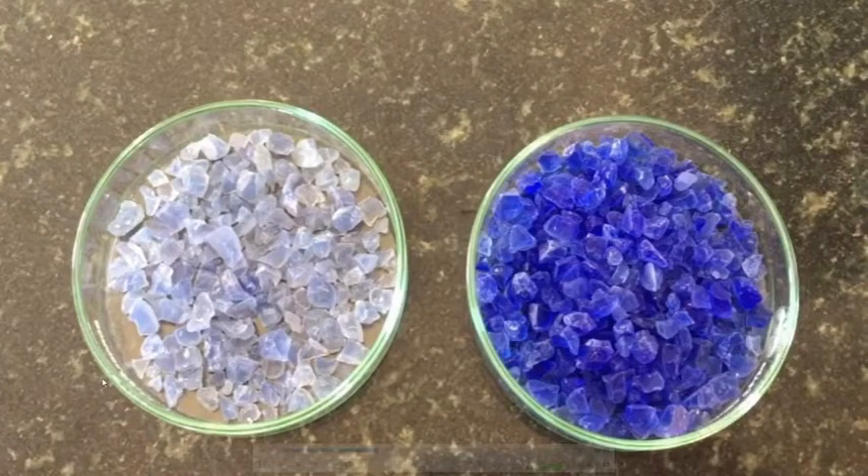Here you can see the left one is the used silica gel — it discharges its color after absorbing moisture. The right one is unused silica gel which is kept tightly sealed in the laboratory.